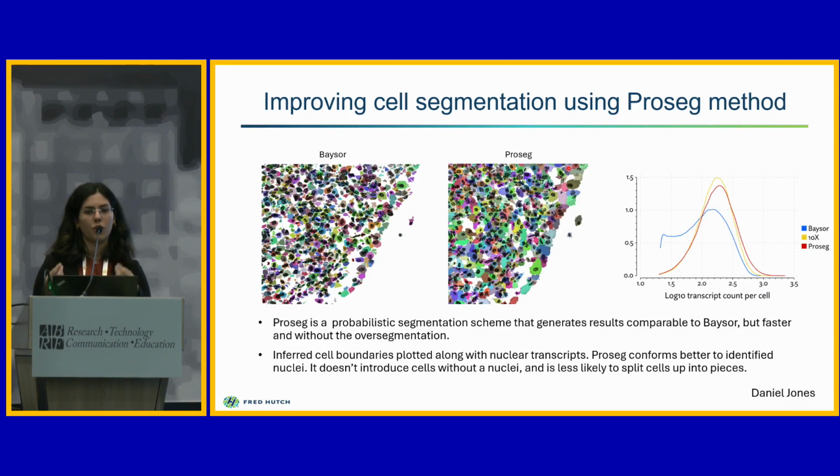That would be those unknown clusters that you will end up with. It is a really common issue because T cells infiltrate into tumor cells, and if you don't have a good cell segmentation in place, you're not sure about annotating your clusters.